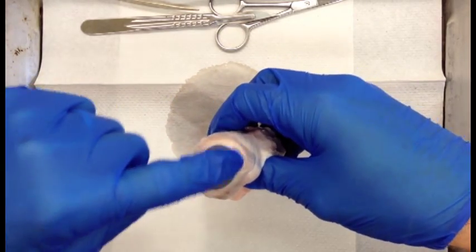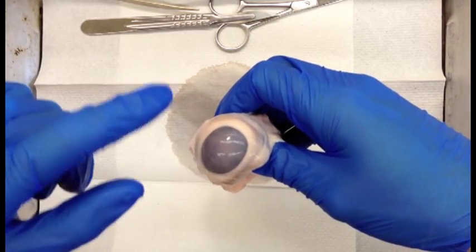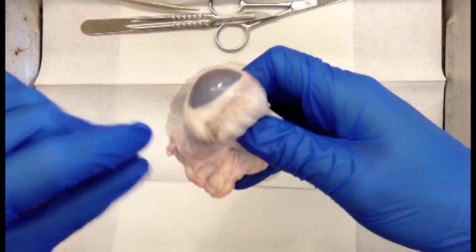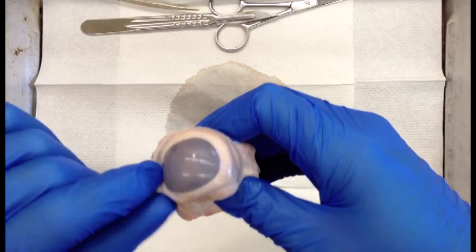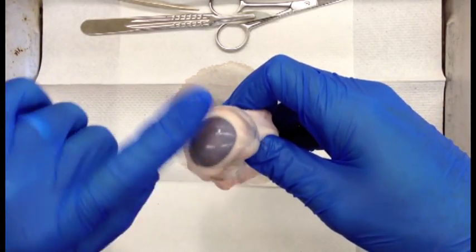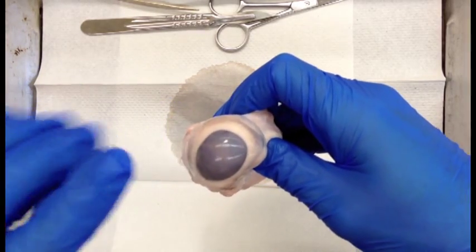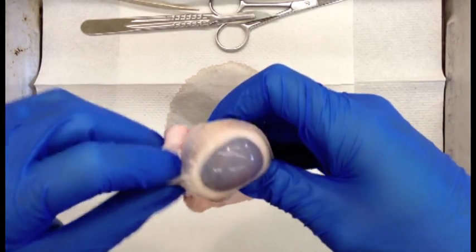So we look at this darker circle here. This is the anterior-most portion. So this is what looks out the eye, and this is actually the cornea. This particular specimen does not have an obvious conjunctiva, but the conjunctiva would be a thin, clear layer that goes over the cornea and actually comes up and fuses with the eyelids. And that's what prevents material, debris, whatever, from getting back behind the eye.